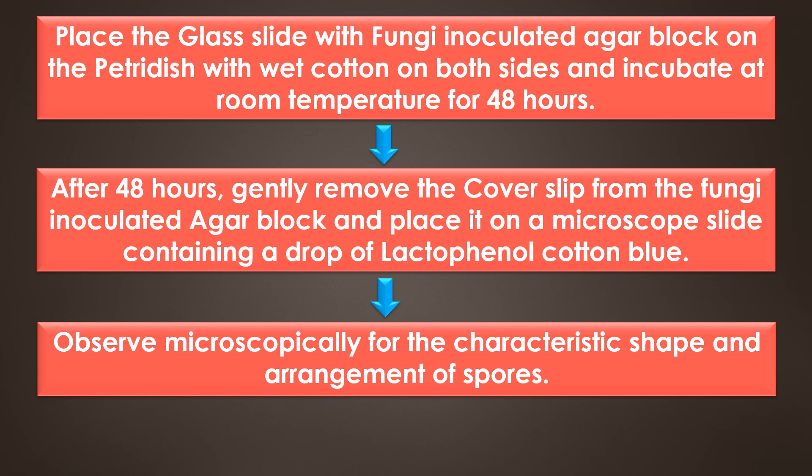After 48 hours, gently remove the coverslip from the fungi-inoculated agar block and place it on a microscopic slide containing a drop of lacto phenol cotton blue. Finally, observe microscopically for the characteristic shape and arrangement of the fungal spores.